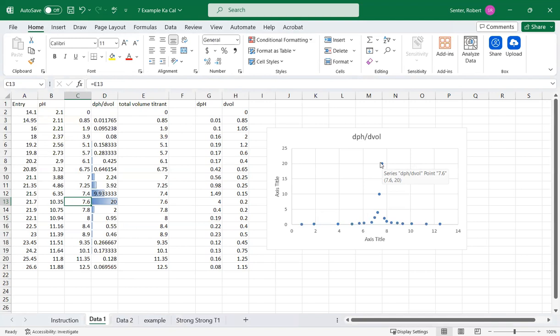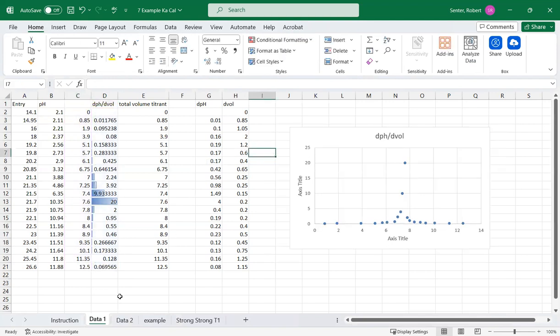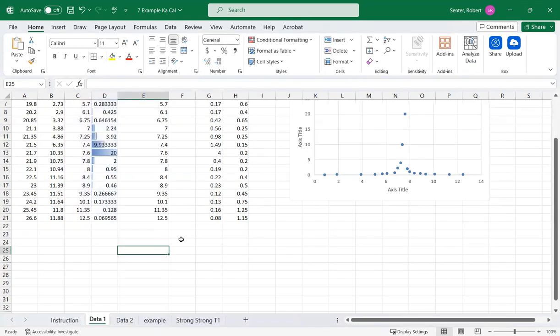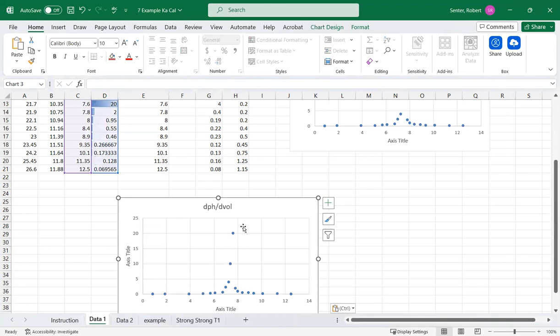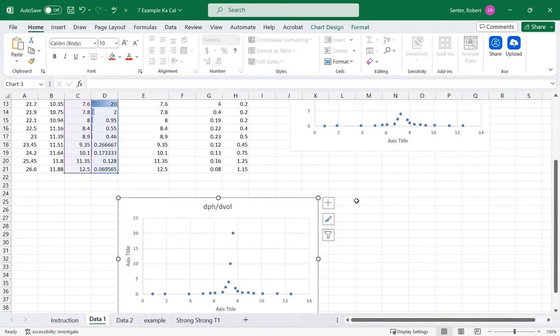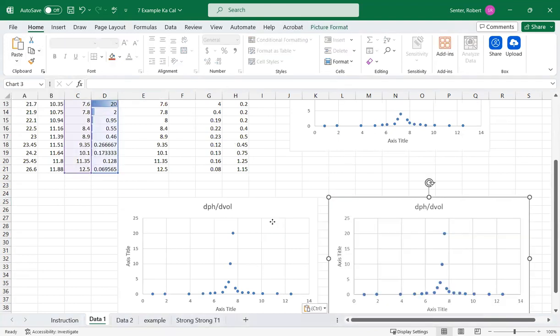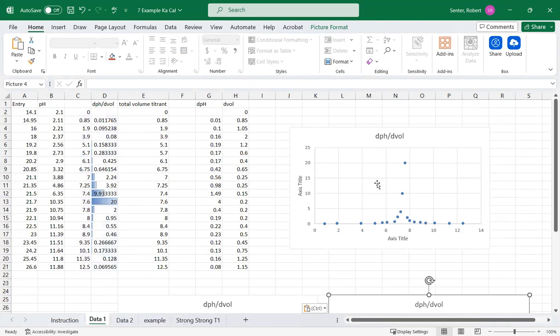That's all you have to do, kind of break it into the individual steps, and then we can put it together and we get the plot of it. All right. The last thing is, you would copy and paste this. And well, actually, you're just going to grab pictures. What I would do though is when I paste it, I would paste special and paste it as a picture. And the thing is here, you can see how it's still selecting the data. It's still matched and stuff like that. So if I copy in the other data, it's going to change it.